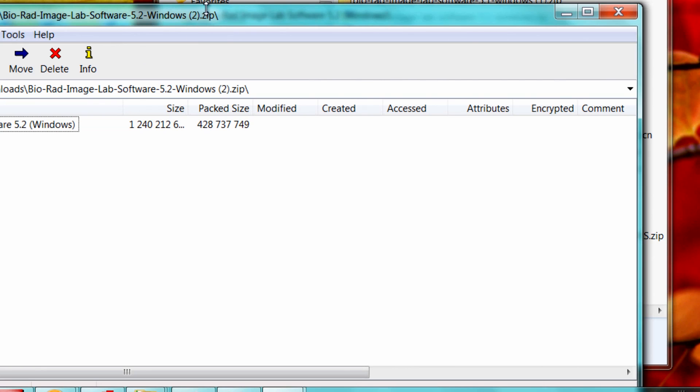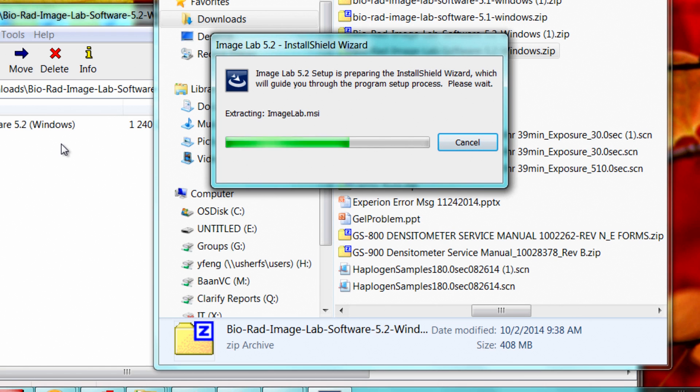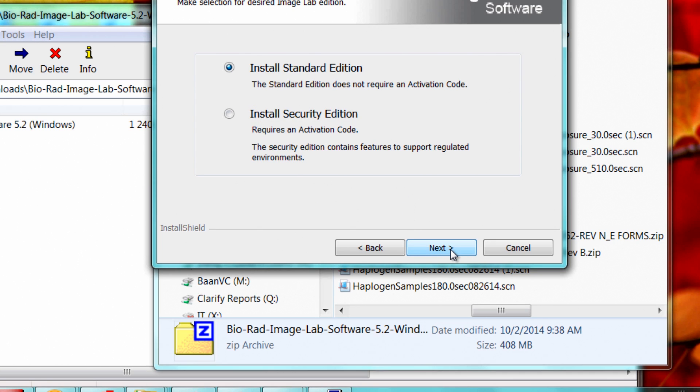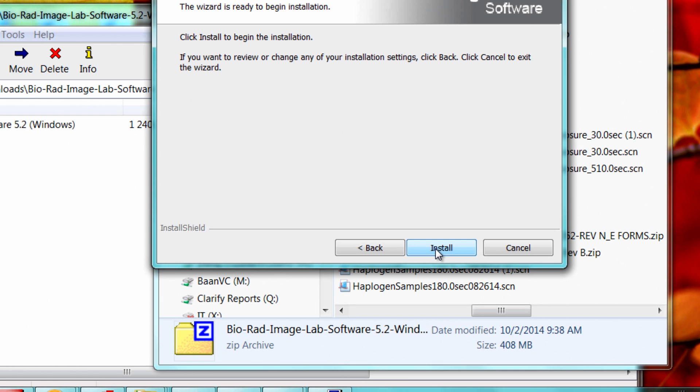To update the software, begin the installation by clicking on the setup file. This will launch an installation wizard that will walk you through the process of installing the software on your computer. During installation you will be asked which software version you wish to install. Most users will want to select the standard edition. Installation of the software security edition requires the purchase of a security edition license. After selecting your software version, click Next to proceed and follow the on-screen instructions to complete the software installation.